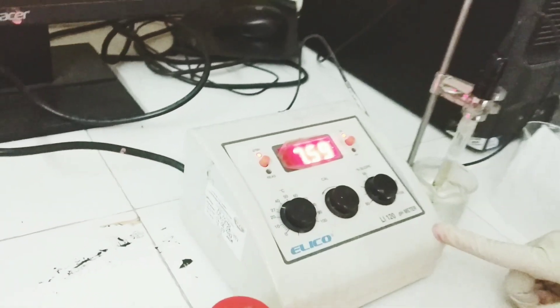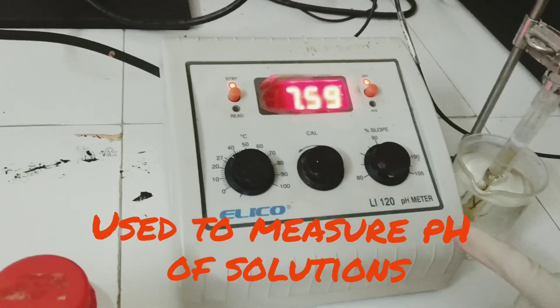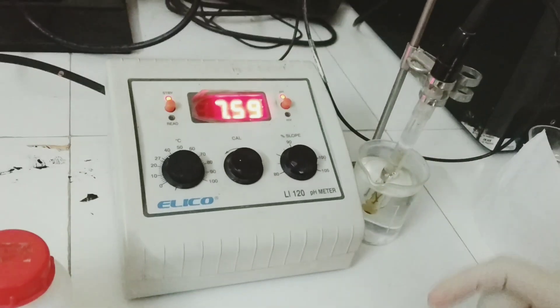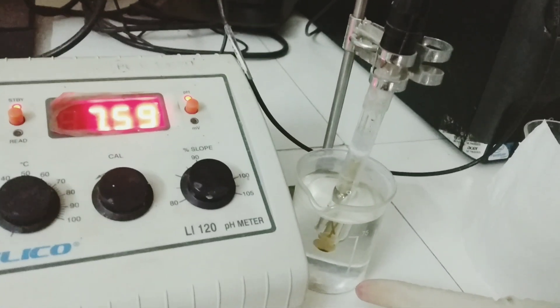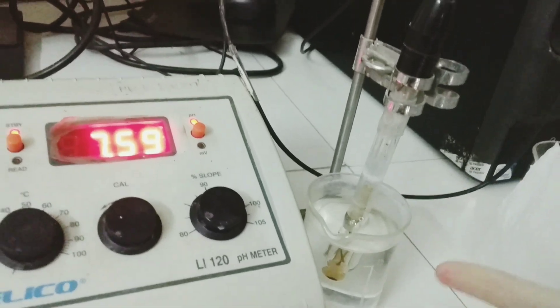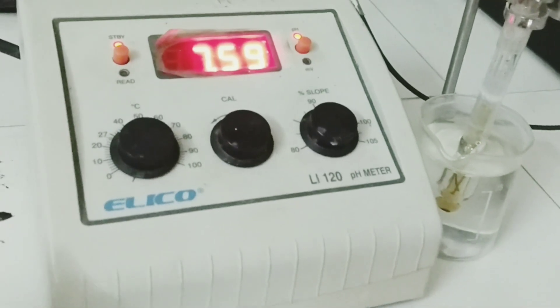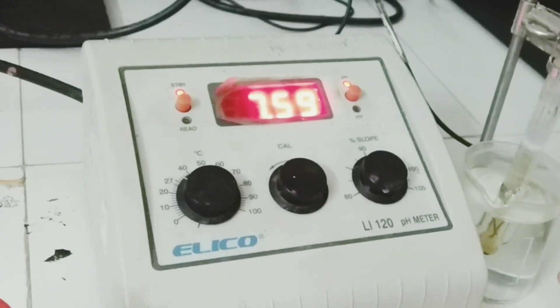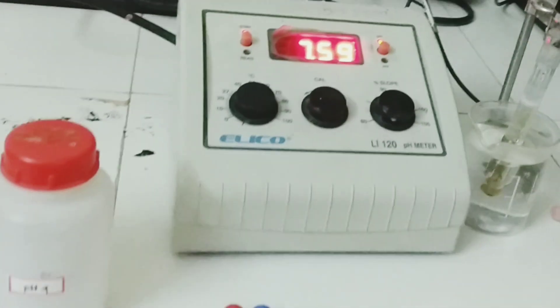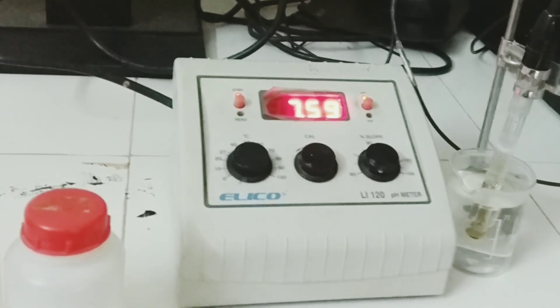This particular instrument is used to measure the pH of solutions. The instrument measures pH with the help of an electrode which is sensitive to H-plus ion concentration. By measuring the voltage of this electrode, we can measure the pH of the solution. This measurement is done relative to a reference electrode, which is also present inside this electrode.